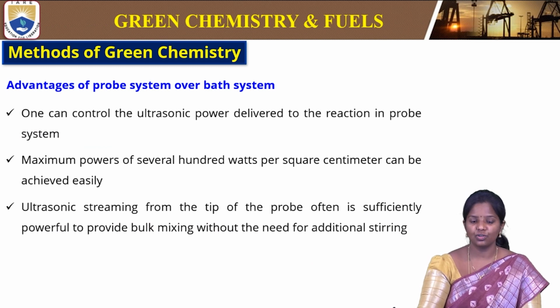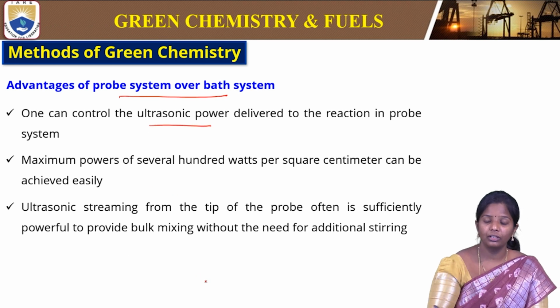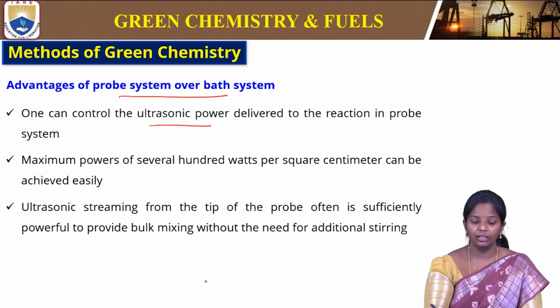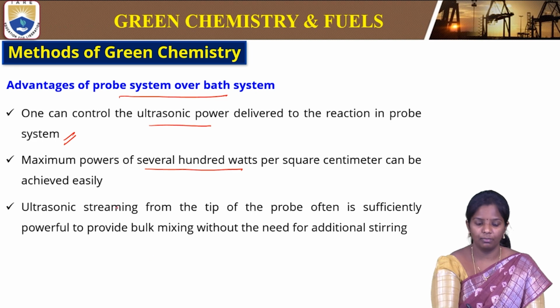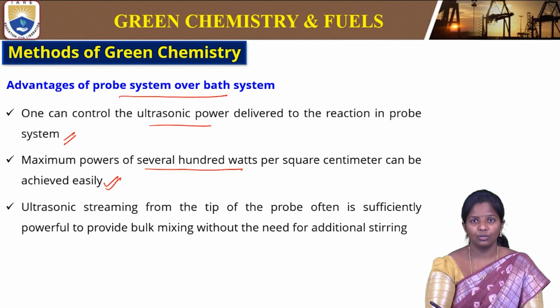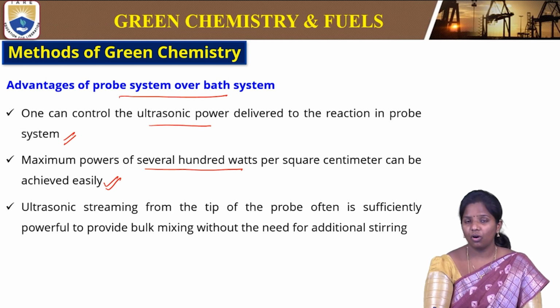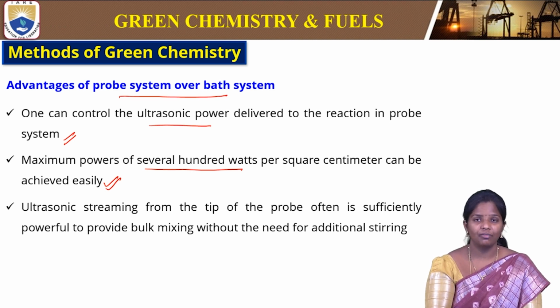So what are the advantages of the probe system over the bath system? One can control the ultrasonic power delivered to the reaction in the probe system. Maximum powers of several hundred watts per square centimeter can be achieved easily. Wherever we introduce the probe, there is no loss of energy, and the electrical energy input will also be reduced, because the area producing vibrations or sound waves will be reduced.